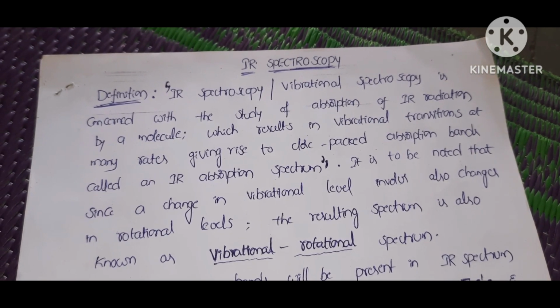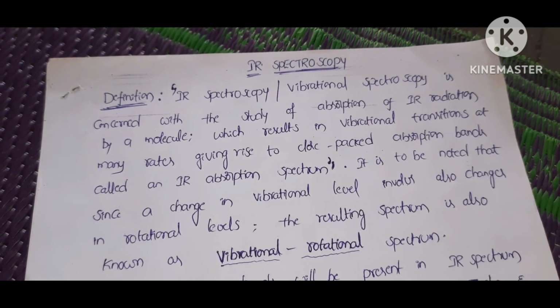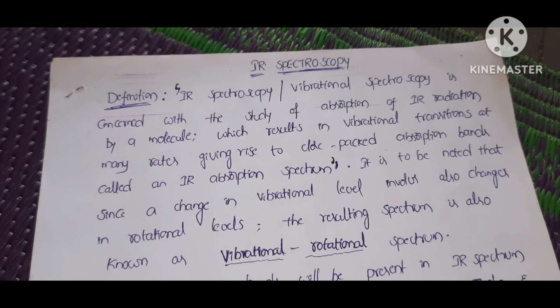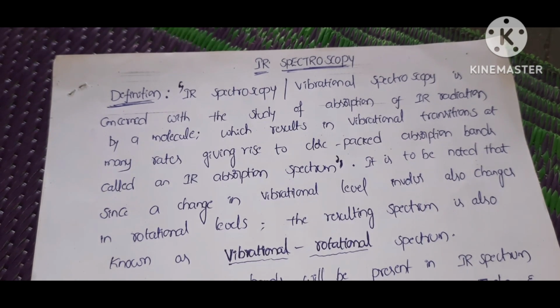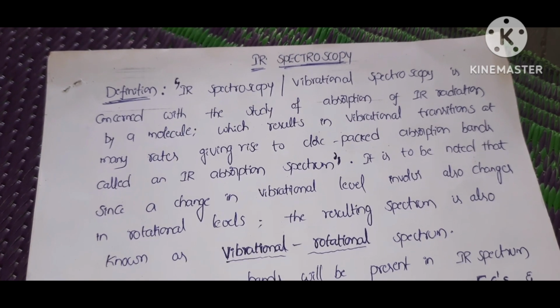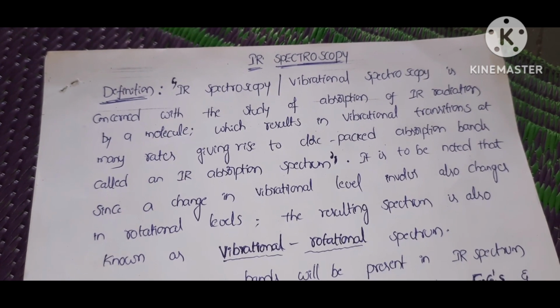In this video tutorial, we will be talking about IR spectroscopy, which is also known as infrared spectroscopy and vibrational spectroscopy. Why is it so named, vibrational spectroscopy or infrared spectroscopy? Let's see one by one.